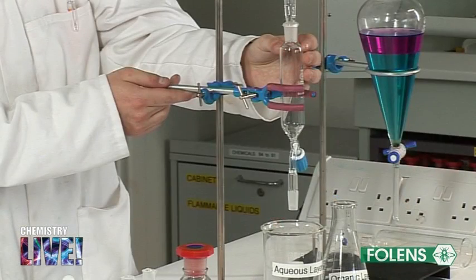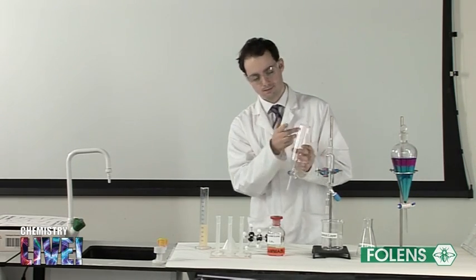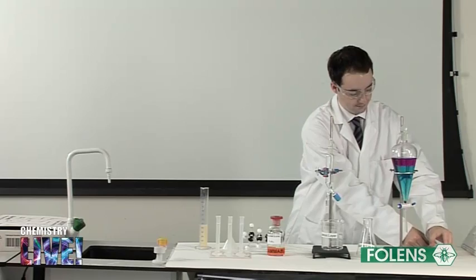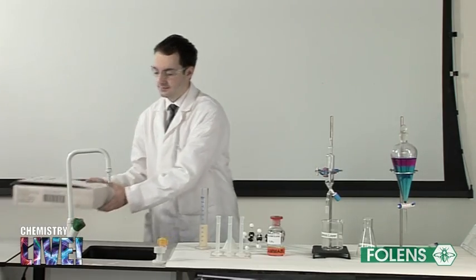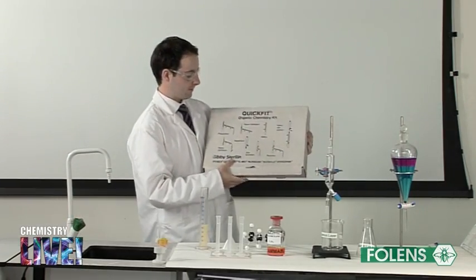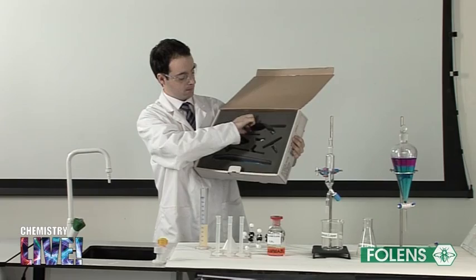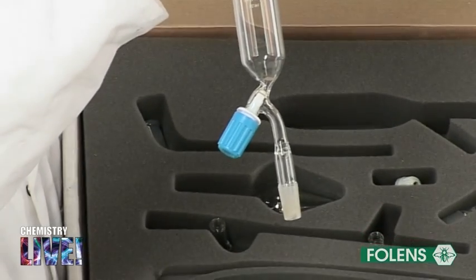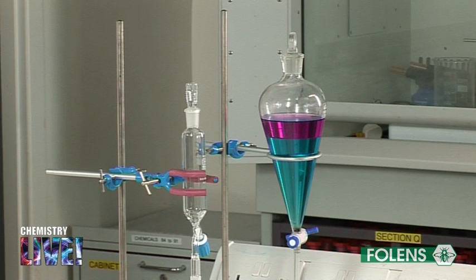A separating funnel is like a dropping funnel, except that the separating funnel has a stopper, but a dropping funnel has no stopper. In this experiment, we will use the separating funnel that is part of the QuickFit 27 BU kit, as this is ideal for dealing with small quantities of liquids. Pear-shaped separating funnels also exist, but these are more suitable for dealing with larger quantities of liquids.